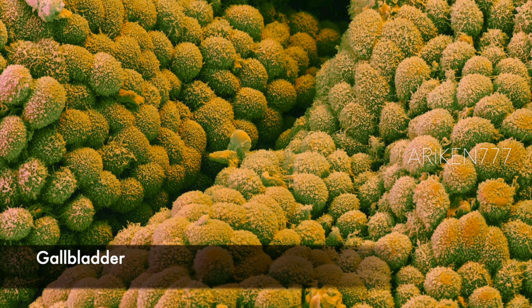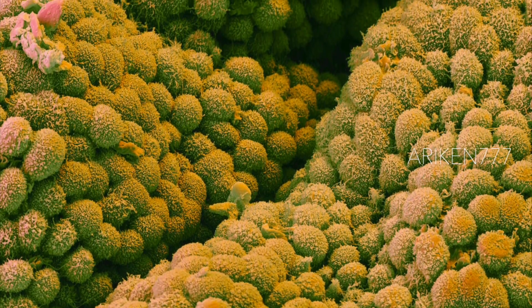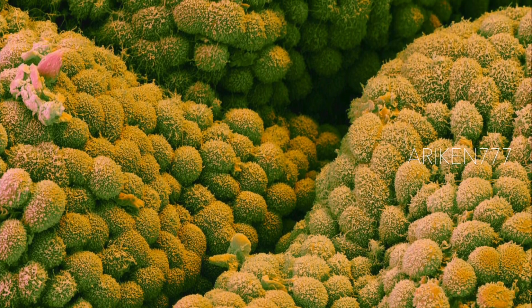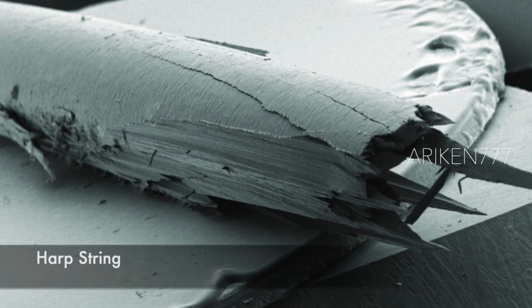The surface of the gallbladder, a pear-shaped sac which stores bile secreted by the liver. This image shows the numerous microvilli that cover the columnar epithelium. A broken nylon pedal harp string.